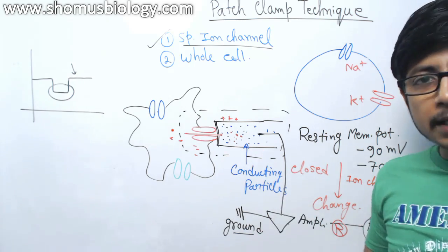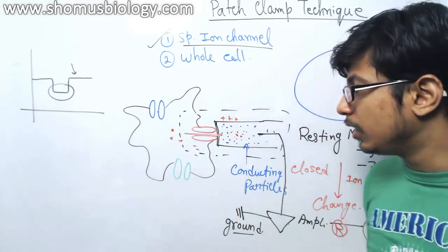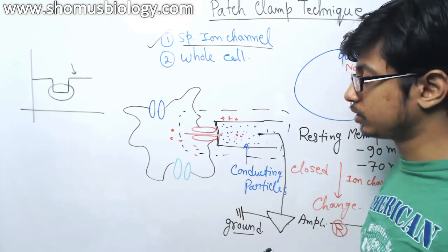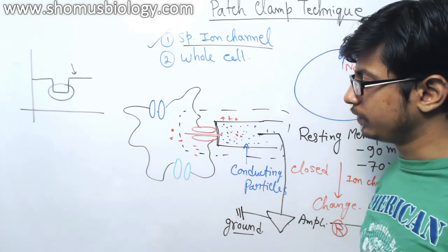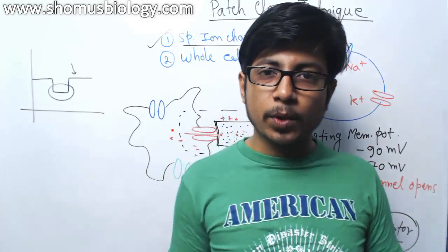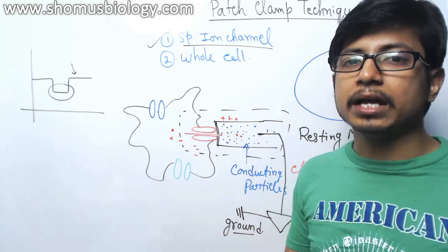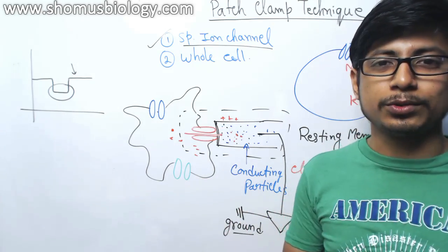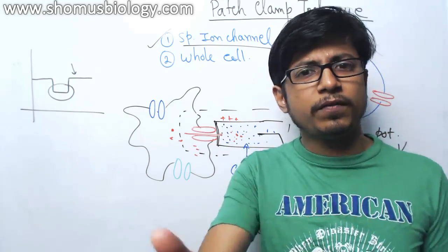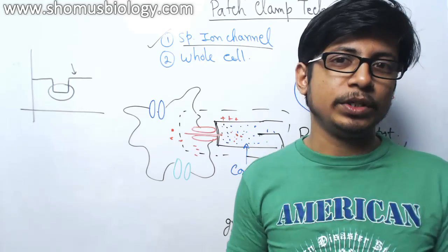So these facilities are mostly available in pharmacological conventions and pharma industries, where we want to know about different chemical factors that can block or help open different ion channels in different diseases and situations, because many of our diseases rely on problems with ion channels opening and closing. So if we find out which molecules inhibit or open an ion channel in response to time, we can develop specific drugs. We can target ion channels with different drugs, and actually you will find a huge number of ion channel inhibitors among the medicines that we use these days.